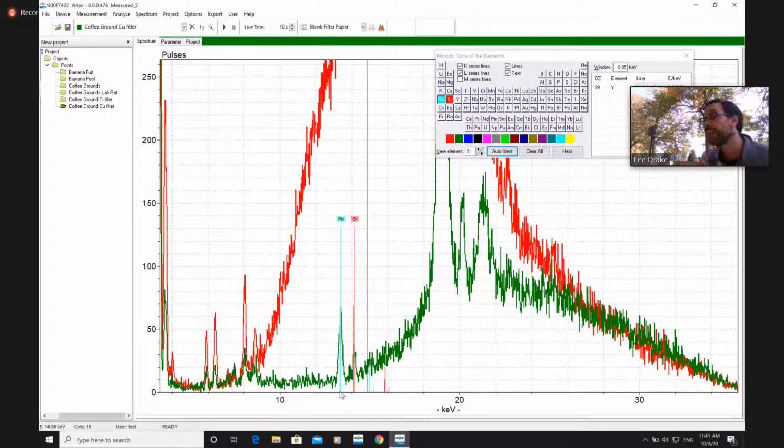We can get into really exciting hypothetical filters, like filters that can let us see cadmium and arsenic down to just 1 ppm. But I think for our purposes, this level does pretty well. But if you have a much more specialized study that you want to question, feel free to email me at b.lee.drake@gmail.com, and I can help you walk through the specifics as you work on that. So I hope that answers your question, Anonymous. That's what guides our choice of features.